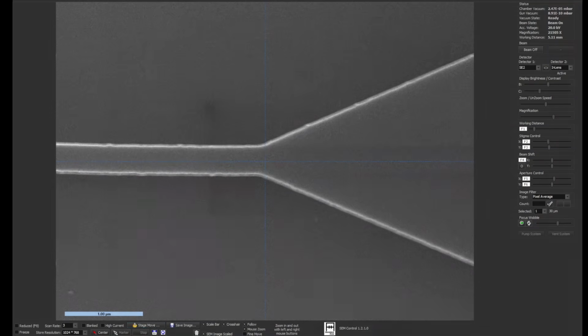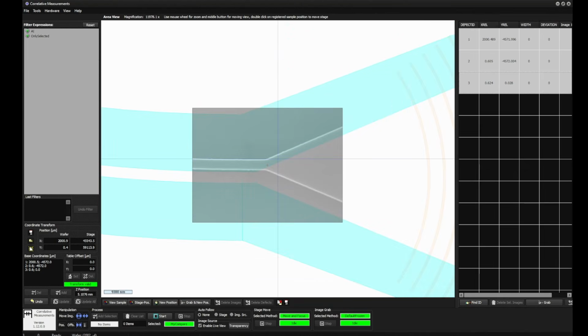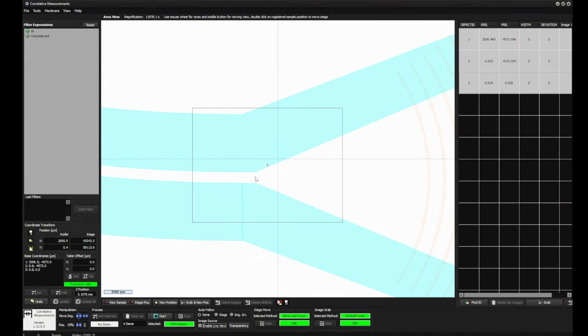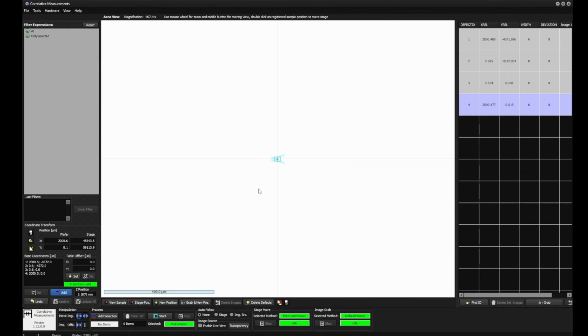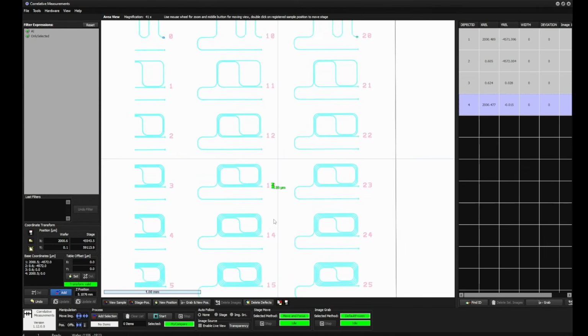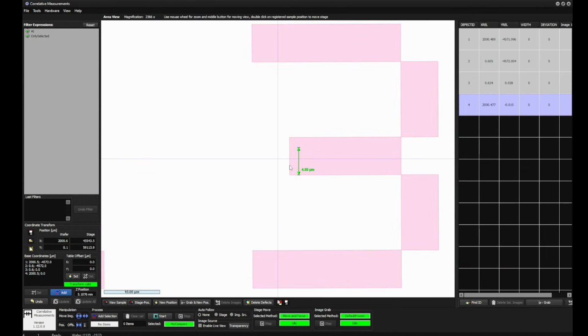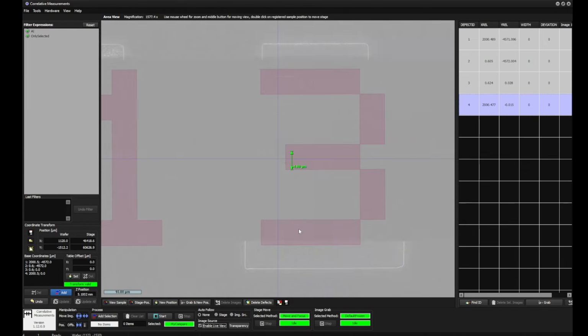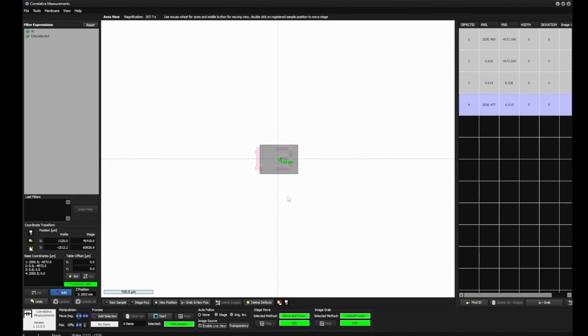So we are here going there, and okay, I just switch off this, and we need to add the point exactly here again. And I add this. You see it moved a little bit closer, and let's just go to this point here where we have checked the precision again and switch on the transparency. I zoom out a little. It got a little better, but not very much.